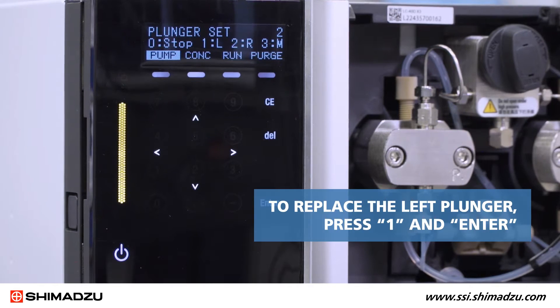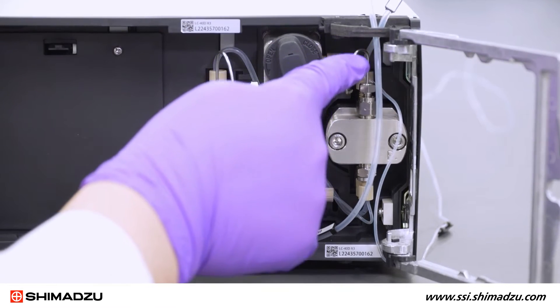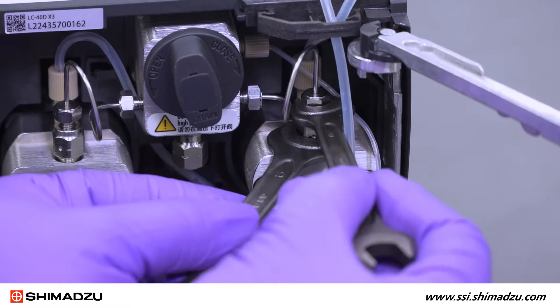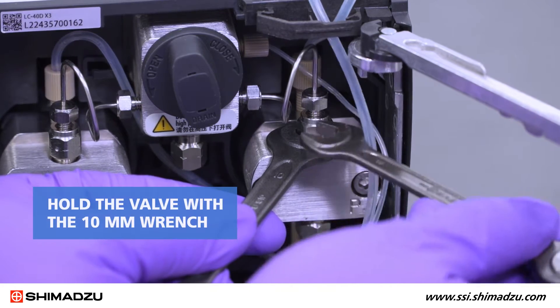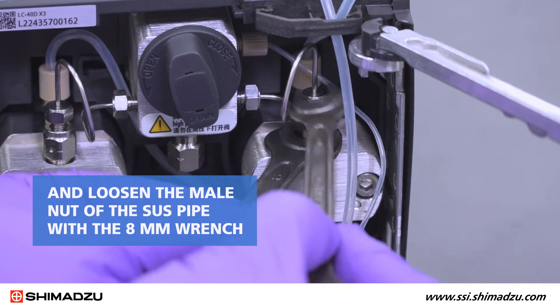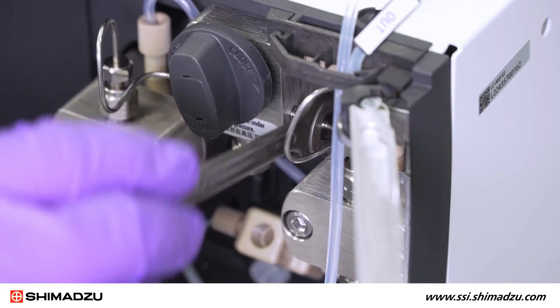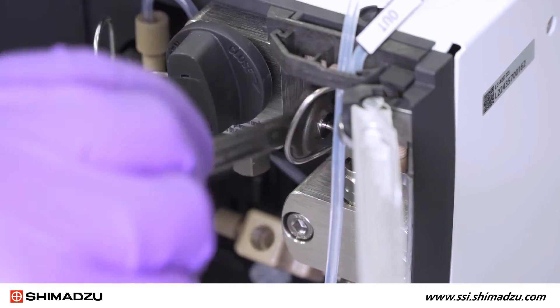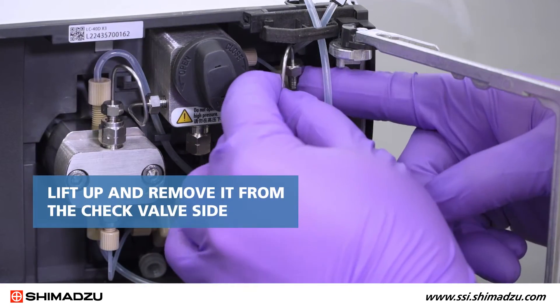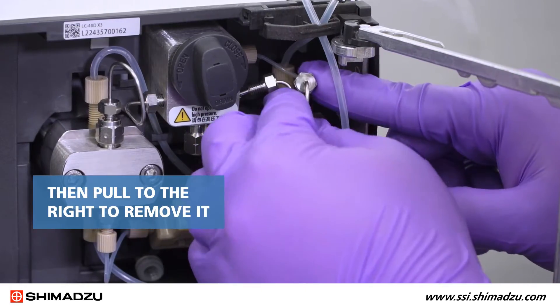To replace the left plunger, press 1 and Enter. Now remove the stainless steel SUS tube connecting the check valve outlet to the pressure sensor. Start with the connection on the check valve. Hold the valve with the 10mm wrench and loosen the male nut of the SUS pipe with the 8mm wrench. Then do the same for the connection on the pressure sensor. Once the SUS pipe is loosened, lift up and remove it from the check valve side, then pull to the right to remove it from the pressure sensor side.